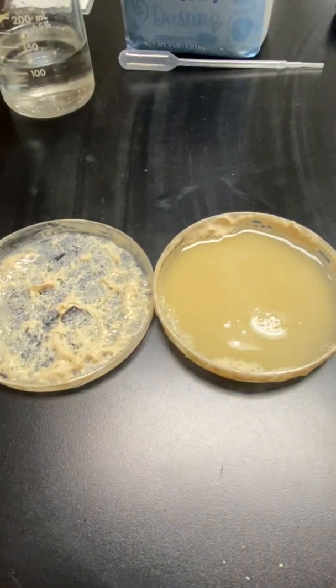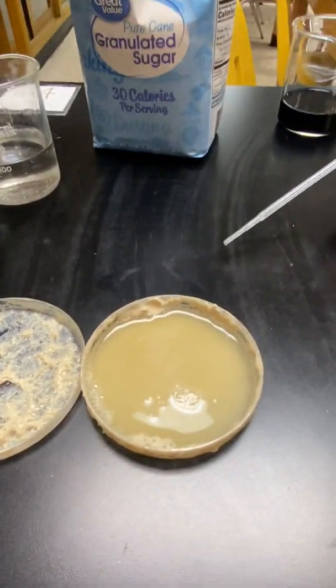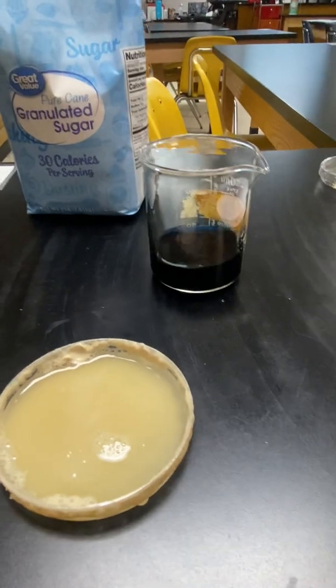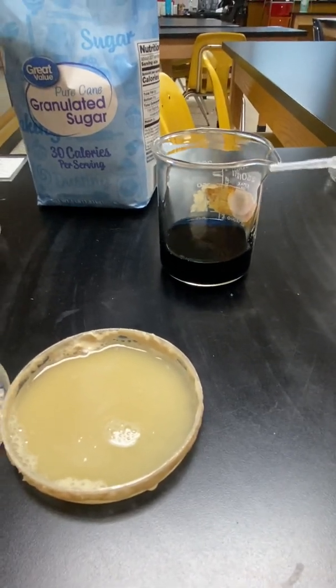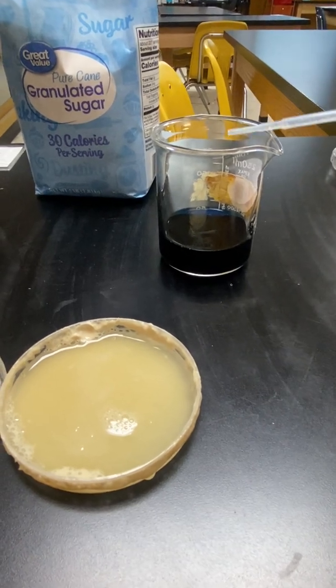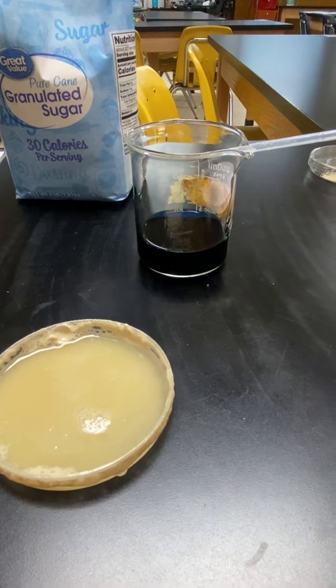So record this observation for number 6. There's one more observation we're going to do. On the next slide, I think it talks about bromothymol blue as a chemical indicator. When an acid is present, the chemical will turn yellow. So if it's less than 6 on the pH scale.